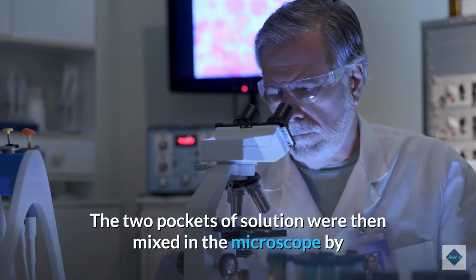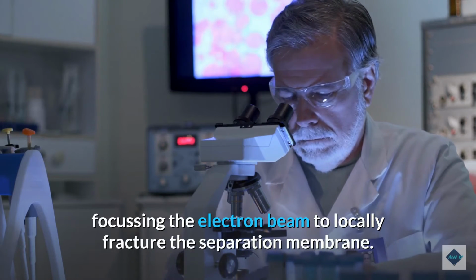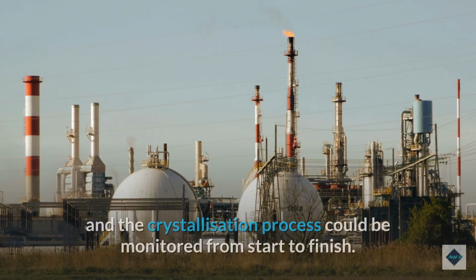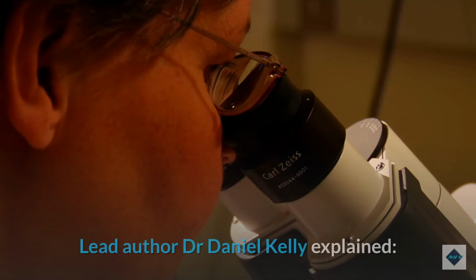The two pockets of solution were then mixed in the microscope by focusing the electron beam to locally fracture the separation membrane. This caused the two pre-loaded chemical reagents to mix in situ, and the crystallization process could be monitored from start to finish.